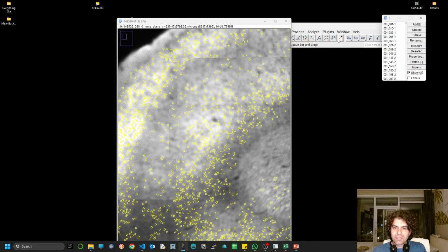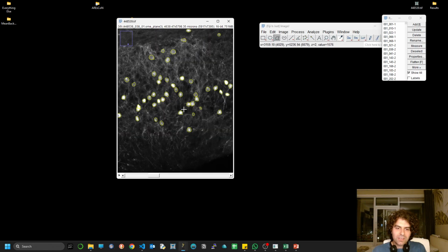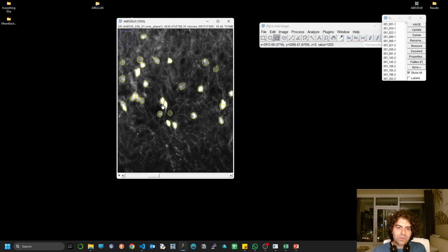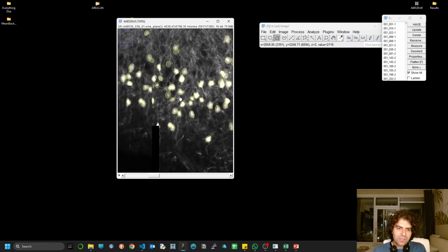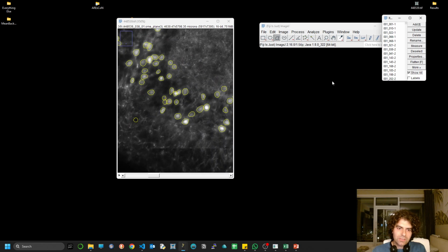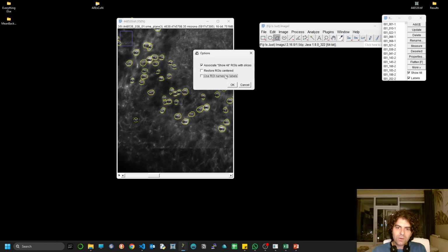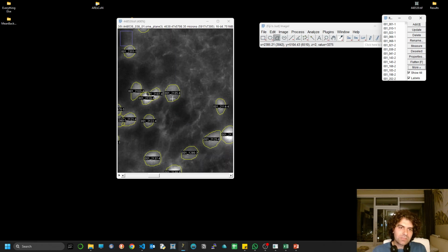Alright, so let's start from these planes, right? And we know that things start becoming clear here, and now I'm going across the observations, and you see that they're more accurate than before, which makes sense because of course now it's including information from all planes and not just one plane at a time, right? And the beauty of it also is that you can see the plane that they're originating from and how well the estimation has been made. So this dash and the number 4 indicates that this is most likely originating from plane 4.